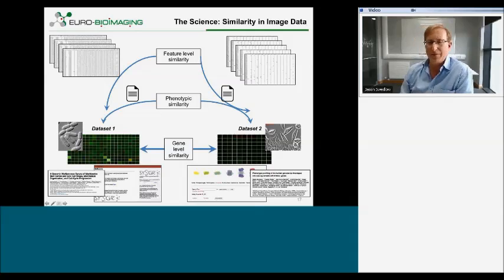So building on top of those two concepts, we imagine that if we could reduce or convert the imaging data in multiple studies into some kind of quantitative feature set, and by this, for example, that you take this thumbnail and decompose it into a series of polynomials that represent in some way the structure of this image, and you do the same with, for example, images in another data set and all other data sets.